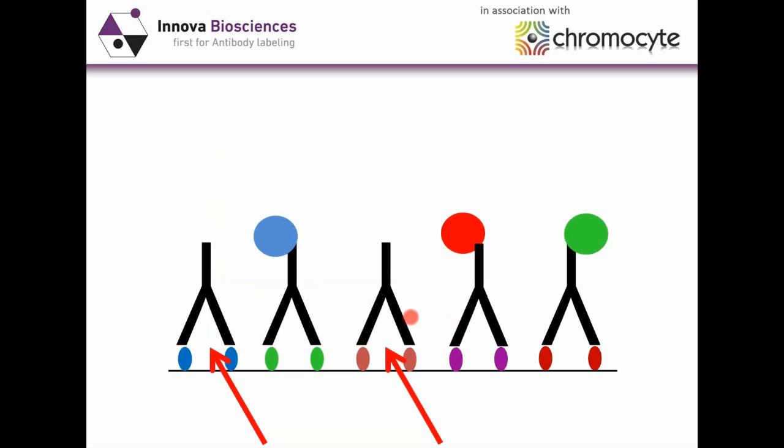The slide I've put up here is really to highlight, however, one of the problems that comes up with the ability to undertake multicolor flow cytometry, and that is in relation to the availability of reagents, particularly directly conjugated antibodies. In this particular example, we're looking at a diagrammatic cell with 5 different antigens on the surface that people want to stain.